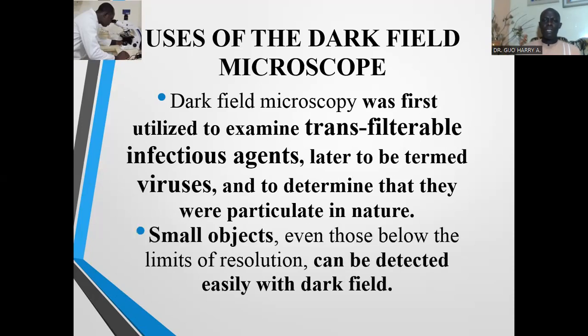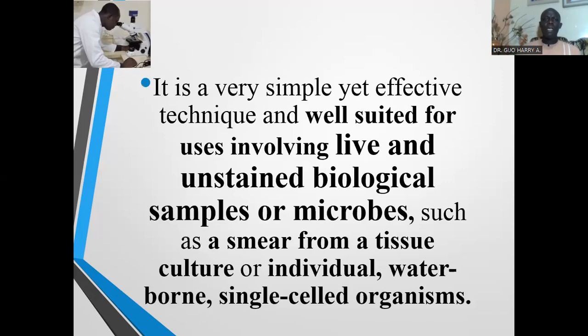Small objects, even those below the limits of resolution, can be detected easily with the dark field microscope as well. It is a very simple yet effective technique and well suited for uses involving live and unstained biological samples and microbes, such as a smear from tissue culture or individual waterborne single-celled organisms.